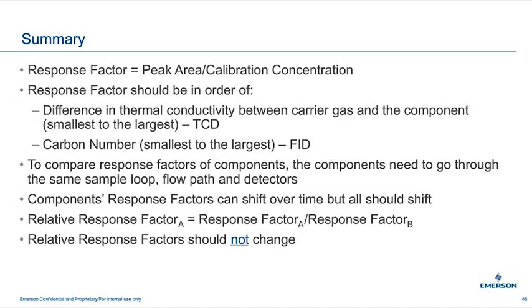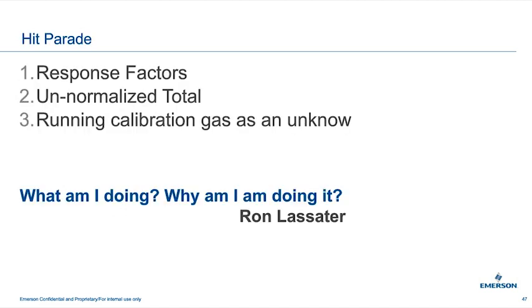So again, this is the hit parade. I do want to give credit to Ron Lassiter. These are really words to live by: before you start trying to fix your GC, ask yourself, what am I doing and why am I doing it? I also heard from somebody else today, a favorite line: don't contaminate my crime scene. So don't start changing things. If you want to understand what the crime was, you need to leave the situation as you found it and analyze what the issue is before you start making changes.